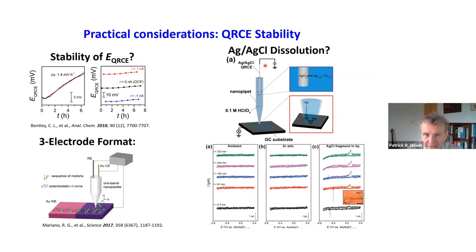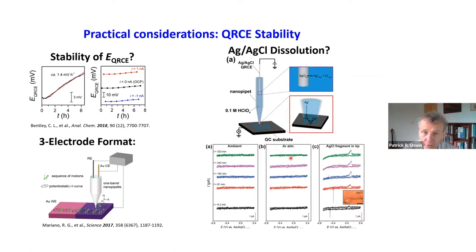Cameron did an experiment where he deliberately placed the silver-silver chloride electrode in the back of the probe in a rough manner and a little fragment of silver chloride broke off. In that case, after a very brief time you have problems — you start to see silver chloride appearing on your surface, messing up the electrochemical process and contaminating the surface due to bad placement of the electrode.